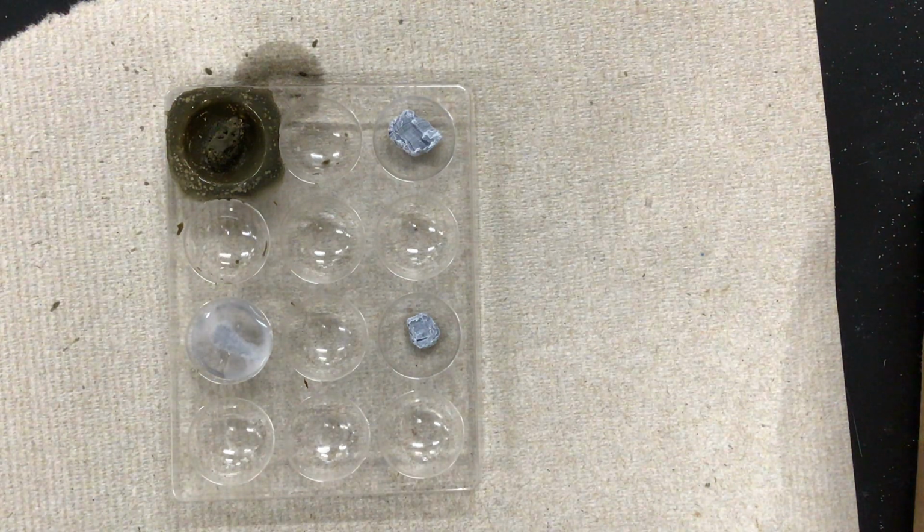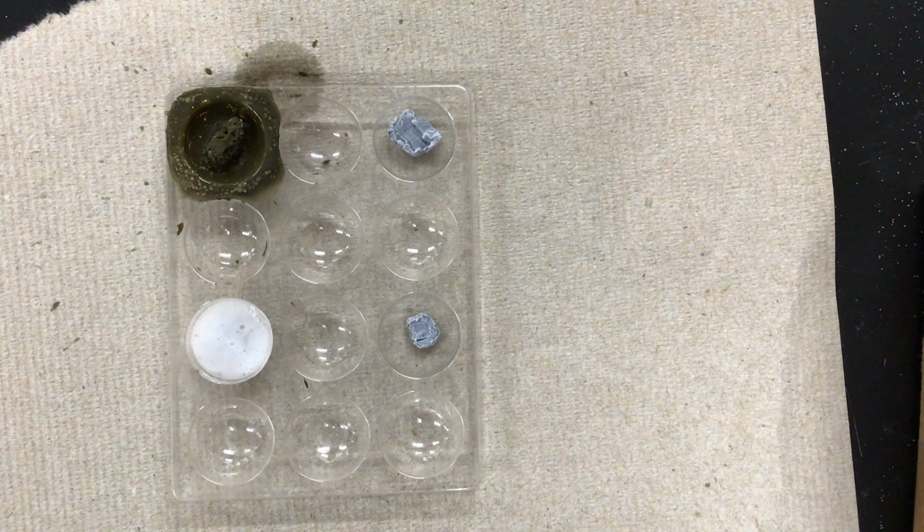So right away, you can see that a gas is being produced, because you can see it start to bubble up. And here the reaction is really getting going now.